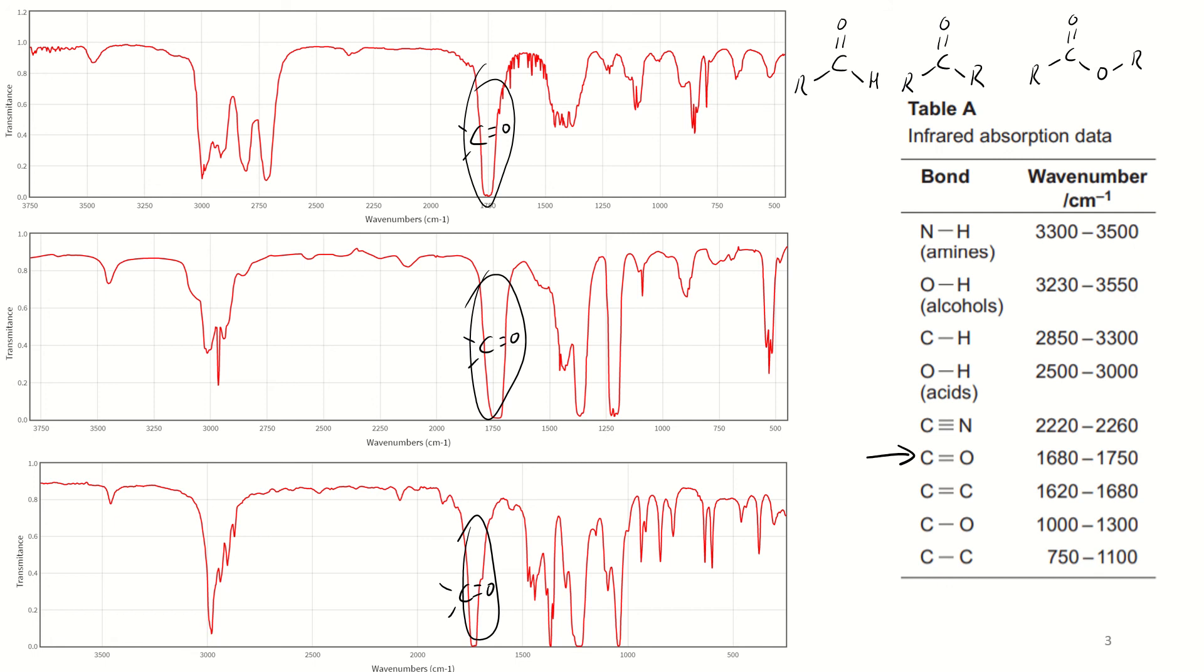So we need some more information to separate these out. Now, the aldehyde's the easiest to spot of the three. This is what's called a Fermi's doublet. It's a little sharp peak, 2720 to 2820, if my memory serves me right. And as we can see that's fairly characteristic of an aldehyde over the other two. They've all still got this CH in there. But the aldehyde's got those couple of extra peaks.